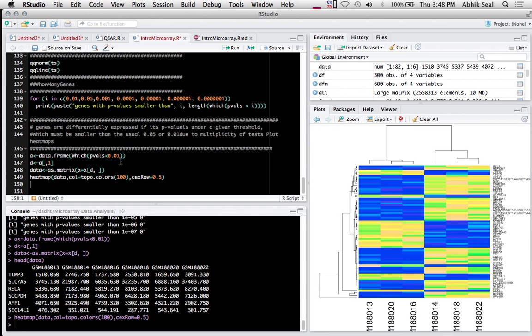These are the control sets and these are the drug-induced sets. When you zoom in, you can see these genes got differentially expressed - this part, this section, and these sections show different gene expression patterns.